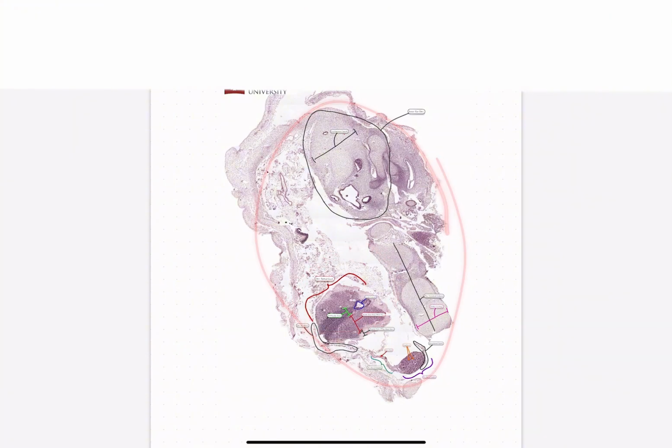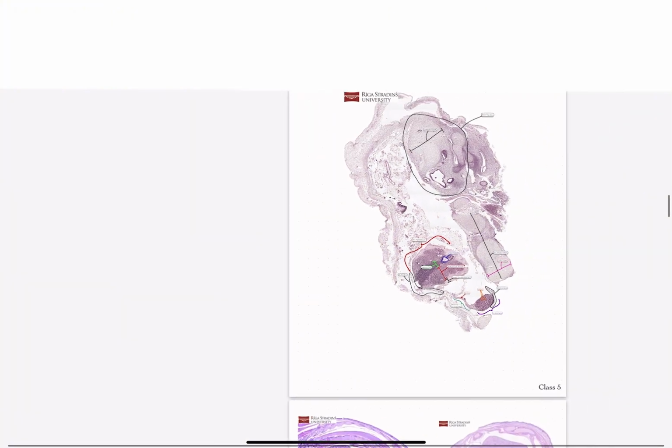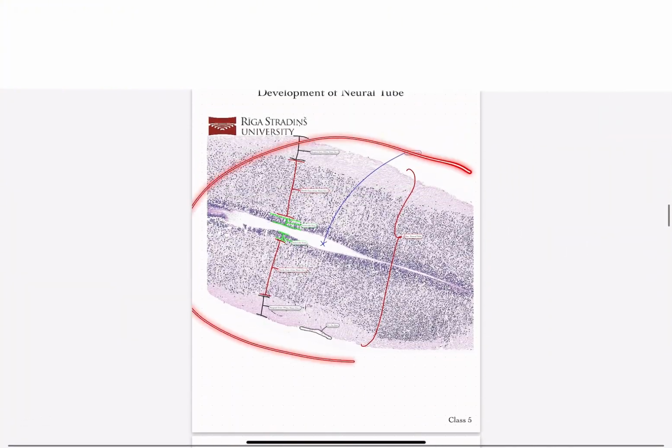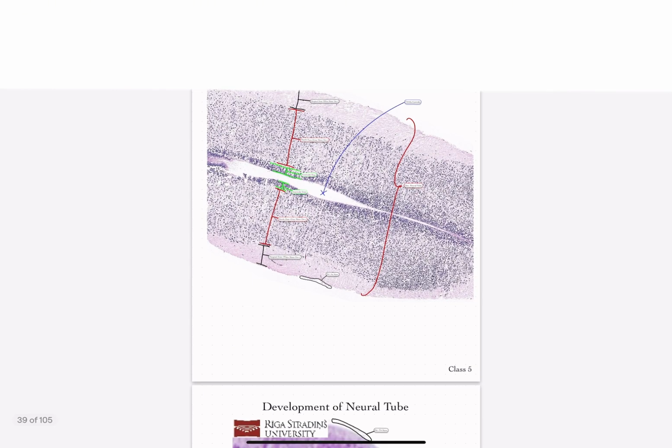So in this case, I would say we're definitely past 4 weeks of gestation, so probably this is more of a spinal cord. However, when it's isolated, like this is the longitudinal version of that structure, then the professor adds the name neural tube. So ask your professors.